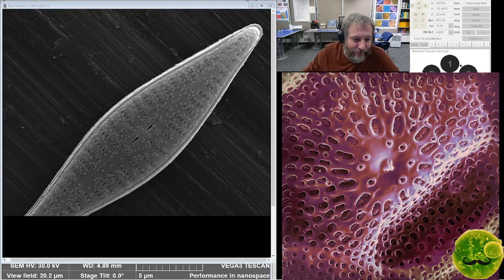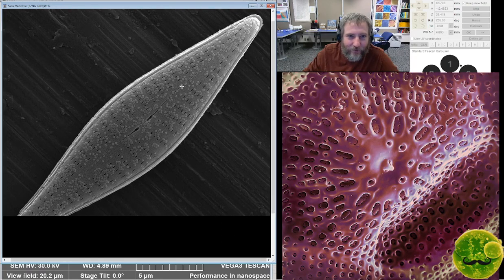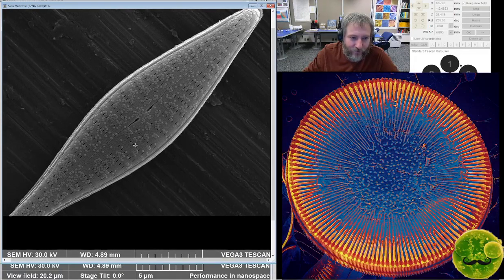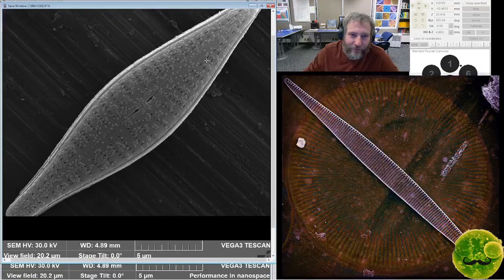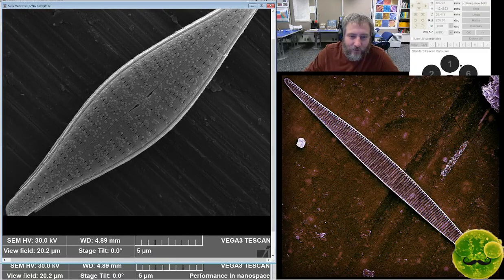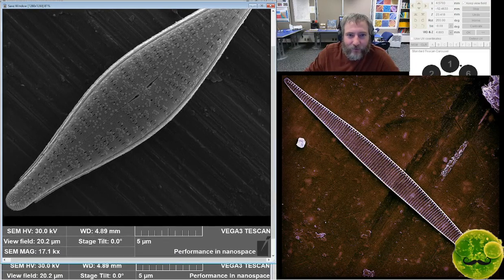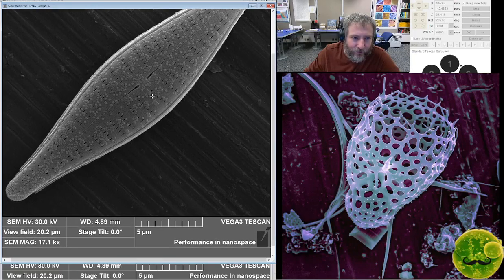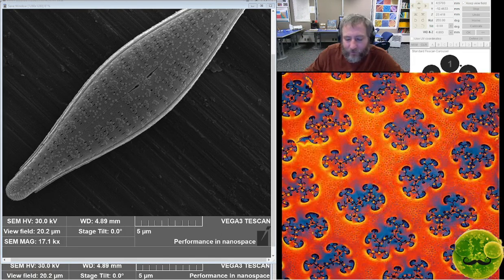And then on this diatom, if you're still watching, the bigger line here is called a raphe, this one. And the little rows of dark holes that are sort of slit shaped, they're lineolate. These are stria, that's what they're called, actually. And the little slits are called areoli or puncta. And then this one is a special one called a stigma. Like, you know, the stigmata in the palm of Jesus. This is 93, yeah.